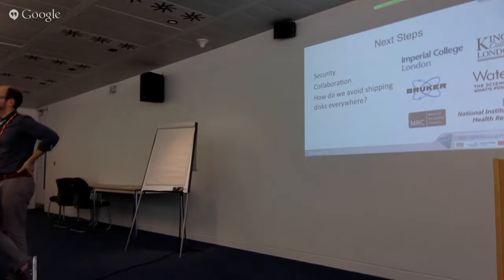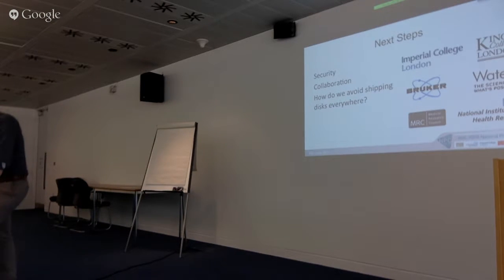So it's significant. One of the problems we have with all of these conversions is there's a tendency to want to move your data centrally, then do the conversion, which I think is a very inefficient way of doing it. To my mind, it's not ambitious. We want to convert data sets to different formats on the fly with a modern computer. It's pretty much idle the entire time it's acquiring data, so there's no reason not to be doing data conversion at that level, rather than centralizing all that data.